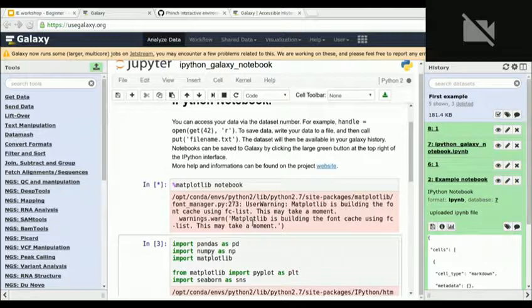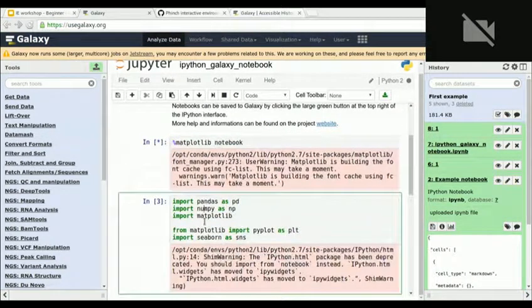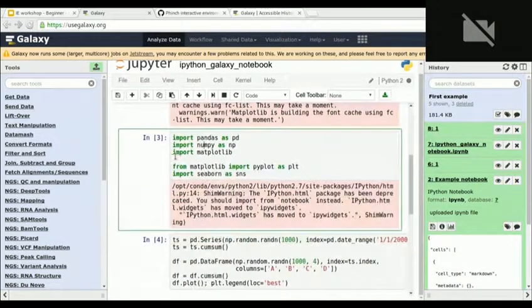You want the images directly in your web browser, and for that you need to have this special annotation. The second cell is just Python modules which you import. So this is now programming stuff. You import the pandas module, you import the NumPy module, whatever. If you are familiar with that, you can change it. Otherwise, you just need to trust me that I send you good code and that you can manipulate your data.